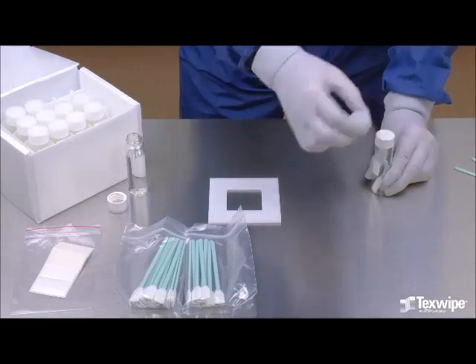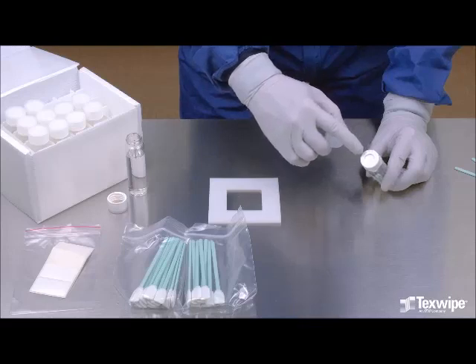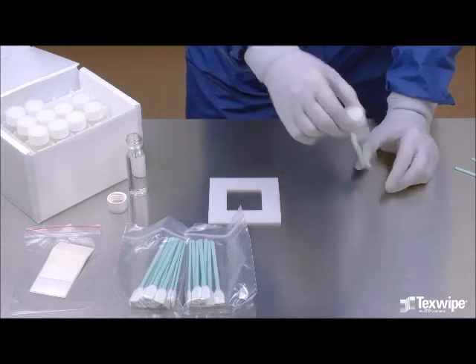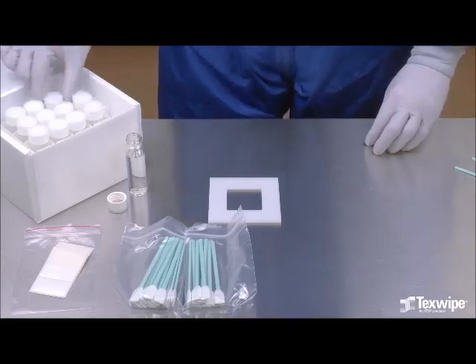The septum in the vial cap is pliable and consists of a chemically inert Teflon inner layer and a silicone outer layer. A polyethylene overcap is used to protect the septum from contamination. The overcap has to be removed before performing TOC analysis.